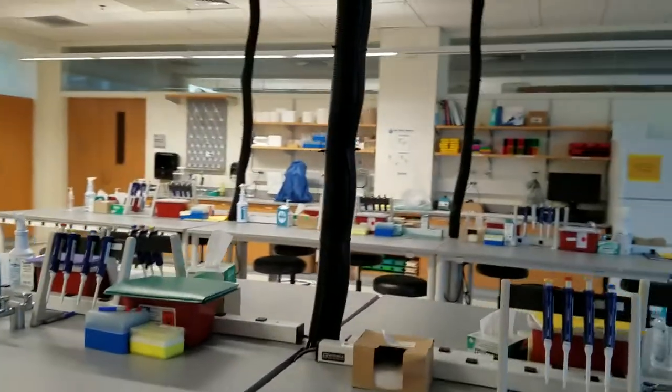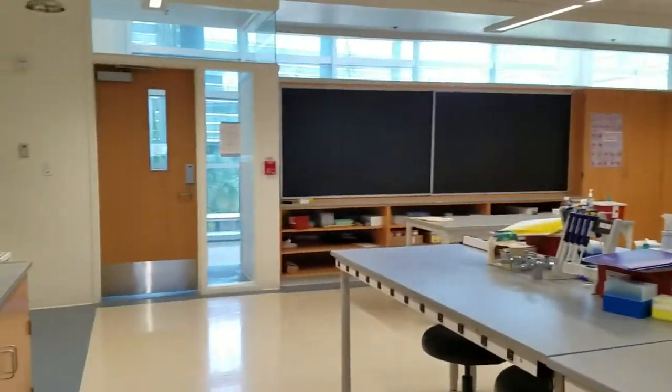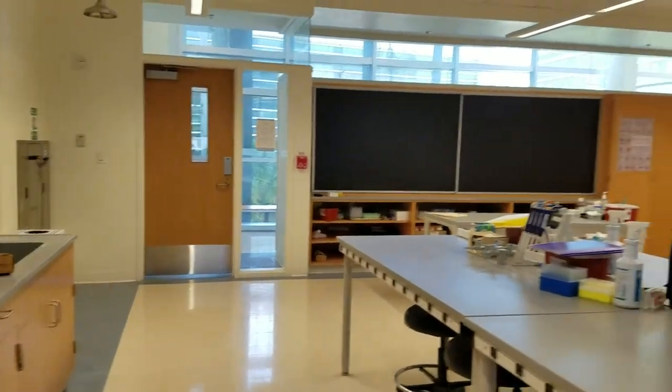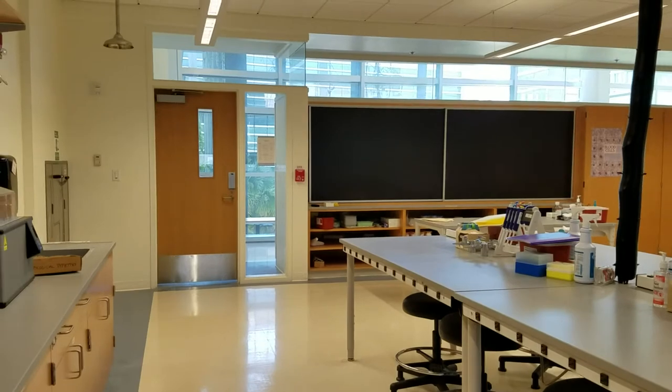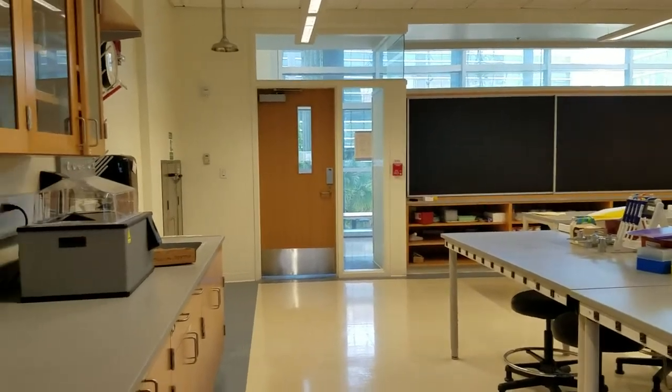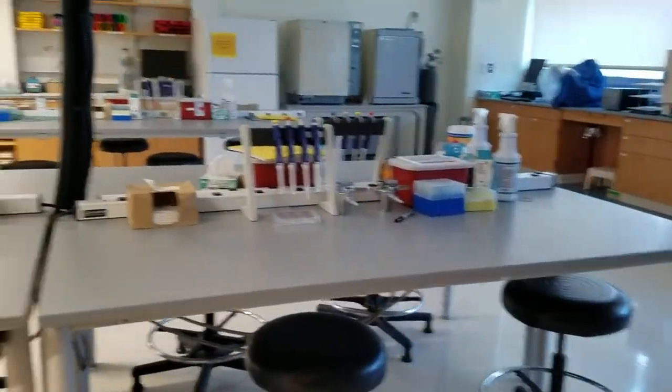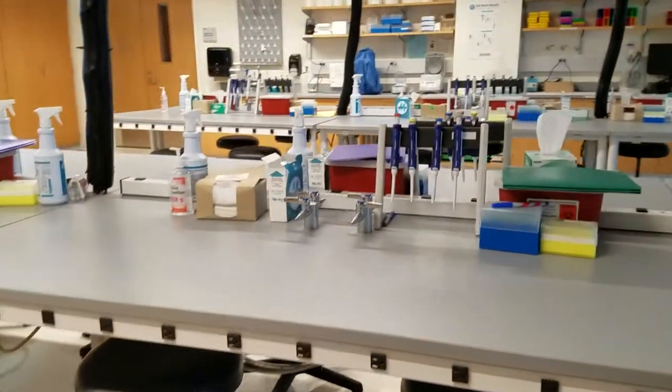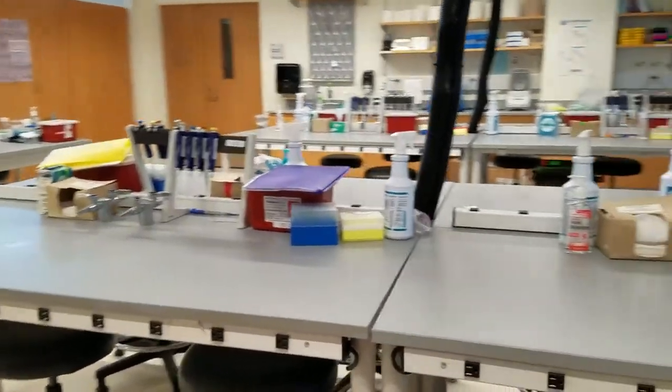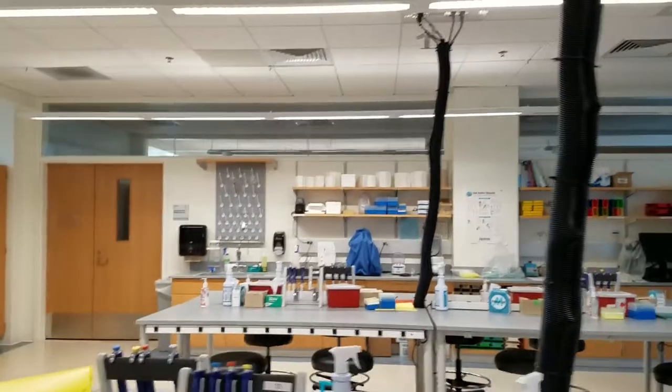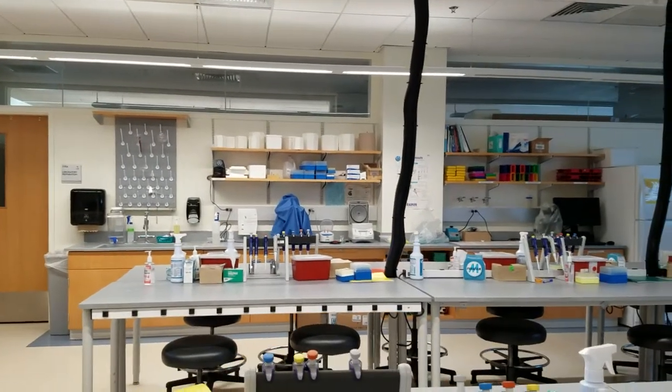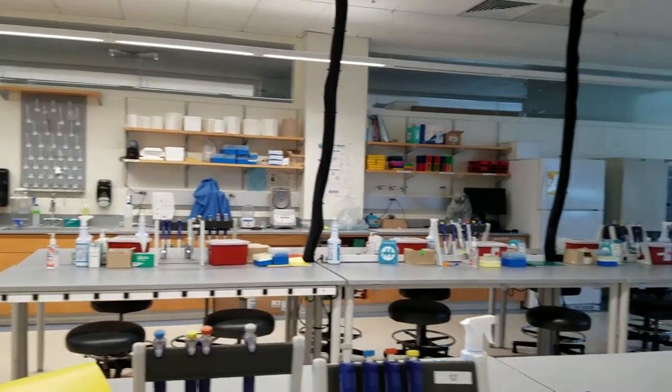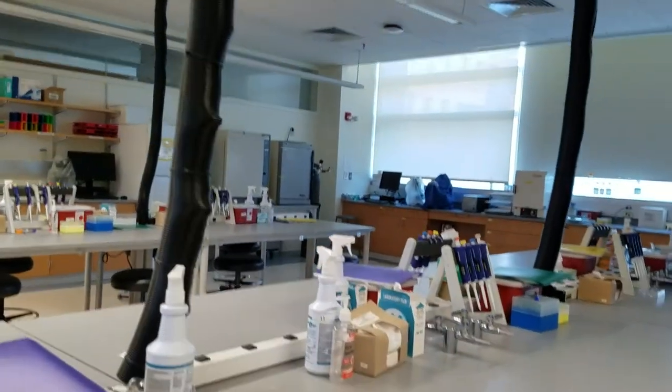Another centrifuge can be found on the other side. If you look at the lab the way it is set up, you have your chalkboard in the front. When you first enter you have the emergency supplies and the glassware on the right, but then you also have your benches. Each bench is set up for each pair of students to work together and do their work, and there's always going to be a sink on either side so students can wash their glassware, dispose of their waste appropriately and things like that.